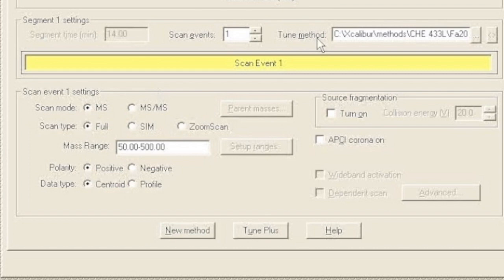So we set our LC method previously. Now we've set our MS method. We made sure the tune method was good. We said we want full mass spectra. We want to scan between 50 and 500 and look for positive ions. So our detector is all set.